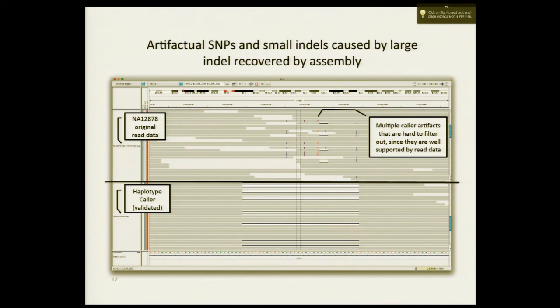Anyway, if this event isn't in your database, then you're sunk. There's basically nothing you could do, right? Potentially it would know that clustered SNPs is a trigger, and Eric mentioned that you could put it in this Smith-Waterman mode where it does a very extensive calculation, and potentially it could come up with this allele, but I think because of the size, 20-some base pairs, it's not going to come up with that.